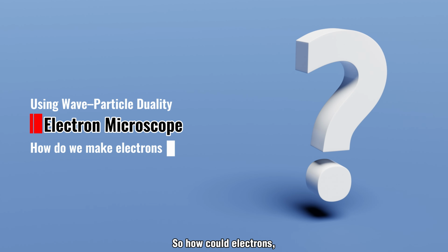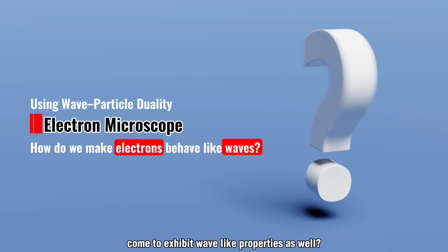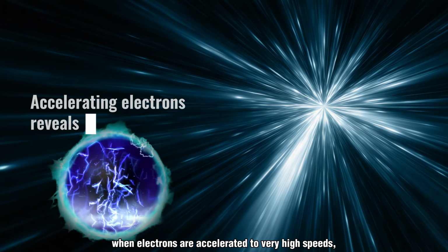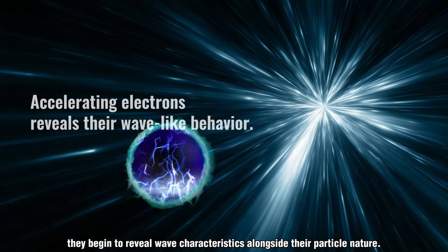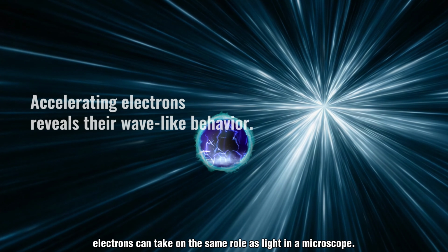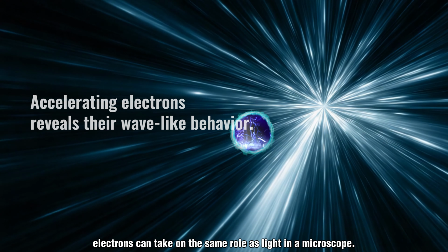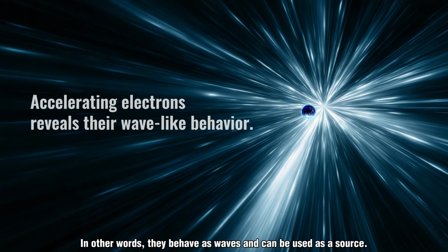So how could electrons, which have such a clearly defined particle nature, come to exhibit wave-like properties as well? Surprisingly, when electrons are accelerated to very high speeds, they begin to reveal wave characteristics alongside their particle nature. And at that very moment, electrons can take on the same role as light in a microscope. In other words, they behave as waves and can be used as a source.